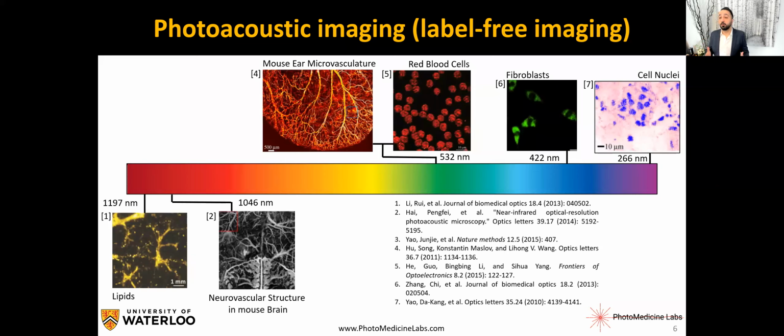So that means using photoacoustic, now we can start looking at new structures and new information that before actually it was not possible to measure or image in the same way. Now we can do this.